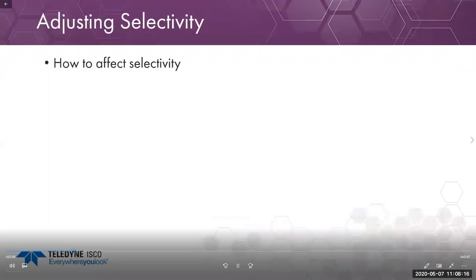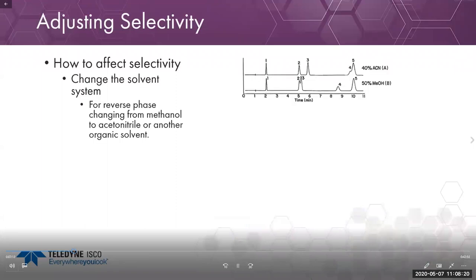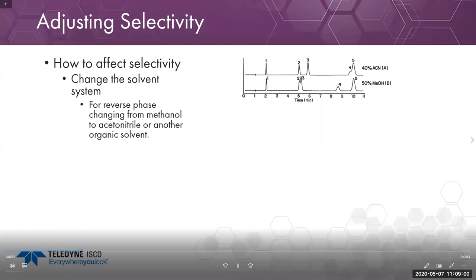Ways to adjust selectivity: one of the easiest is to change your solvent system. In this analytical example with a five-component mixture, peaks one, two, and three elute clearly but four and five co-elute in 40% acetonitrile. Switching to 50% methanol, peaks two and three now co-elute, but four and five are now isolable with baseline resolution. So depending on which compound you're interested in purifying, one method is more suitable than the other.